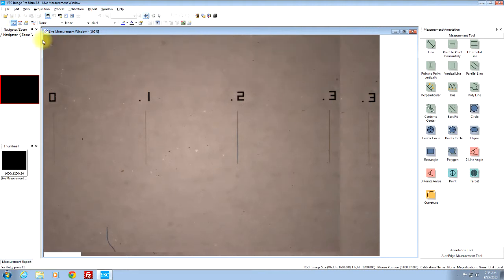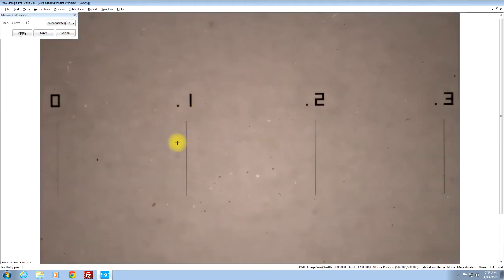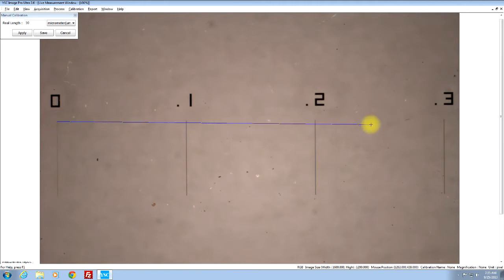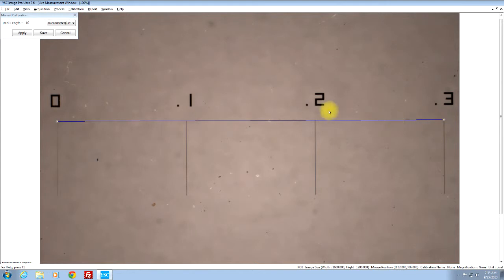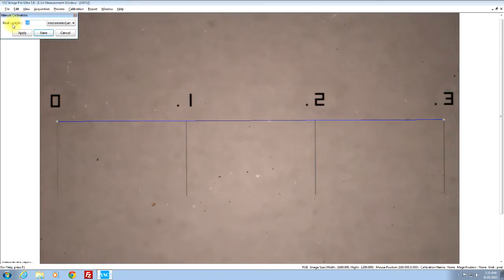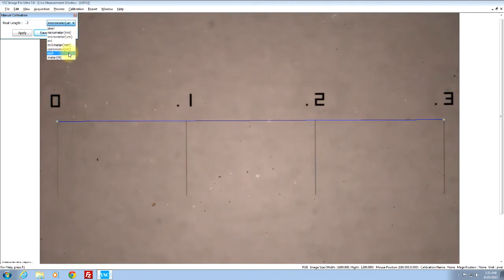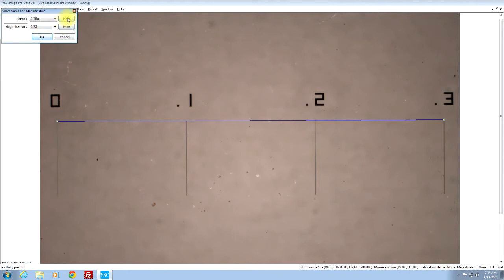Basically what you're going to do is just click on the tip to tip. In this case it's going to be 0.3 inch, so we're just going to enter 0.3 and select the unit inch.